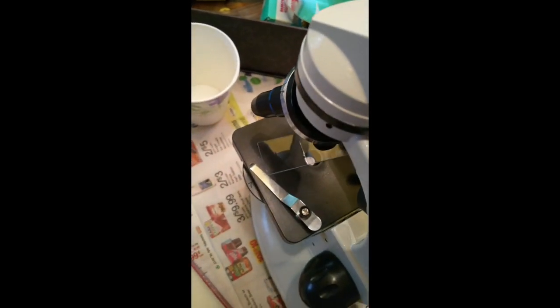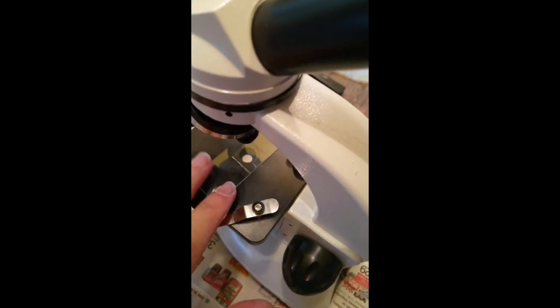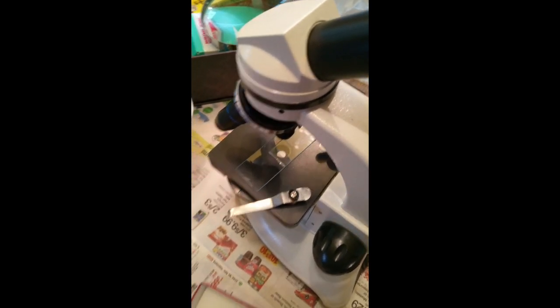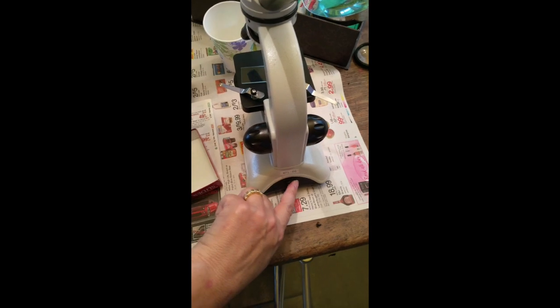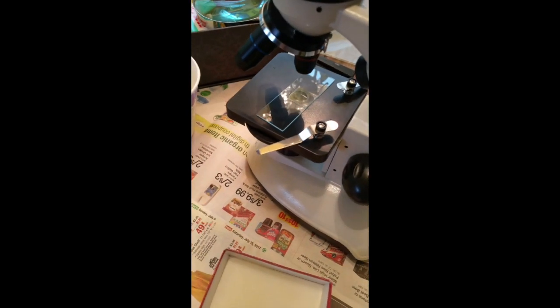I'll place the slide right here on the microscope, put my clips on, put the power on, and that gives me a little bit of light underneath. Now we'll see what we can see.